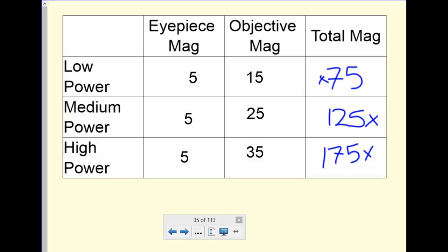And depending on whether you have a transmission versus a scanning electron microscope, you might have to coat things in gold too. So you have to cut things in gold. This would get us up to about 400 times magnification, but there are stronger microscopes out there that allow us to see at an incredibly high magnification.